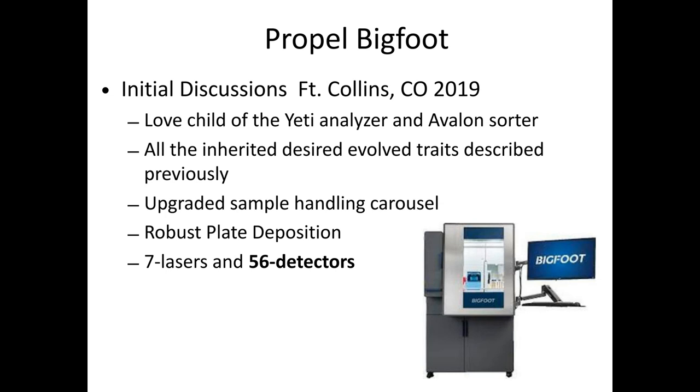When I came in, I called this instrument the love child of the Yeti analyzer and the Avalon sorter. It had a lot of the high dimensional features of the Yeti, and it had a lot of the automated features of the Avalon, and it was all put into one system. So it was all the inherited traits I described previously, and it had a pretty cool thing.